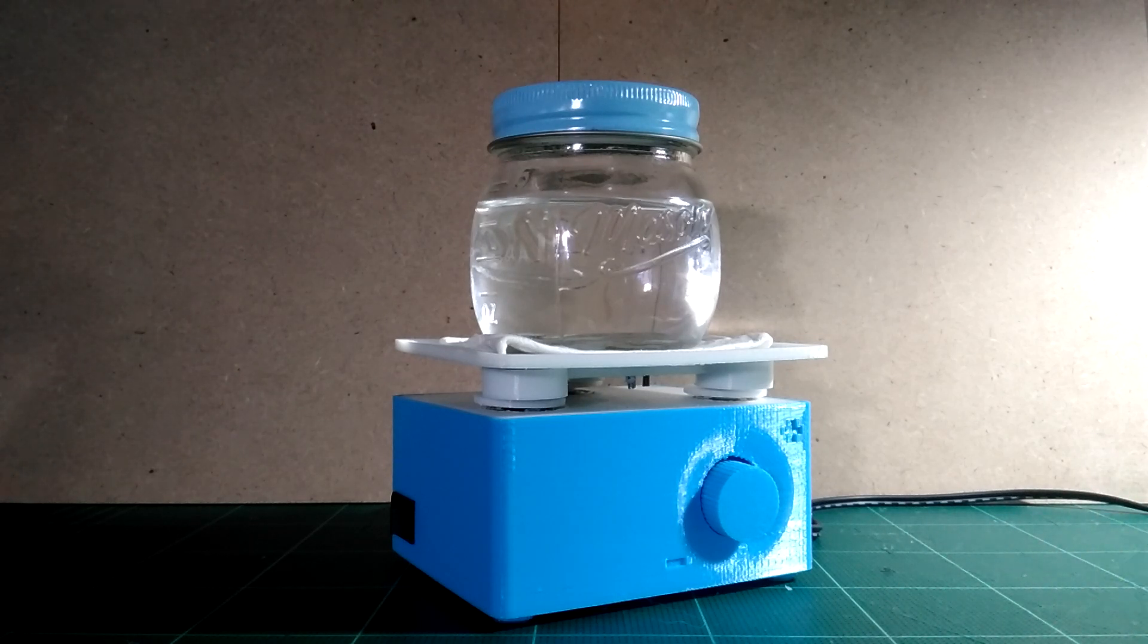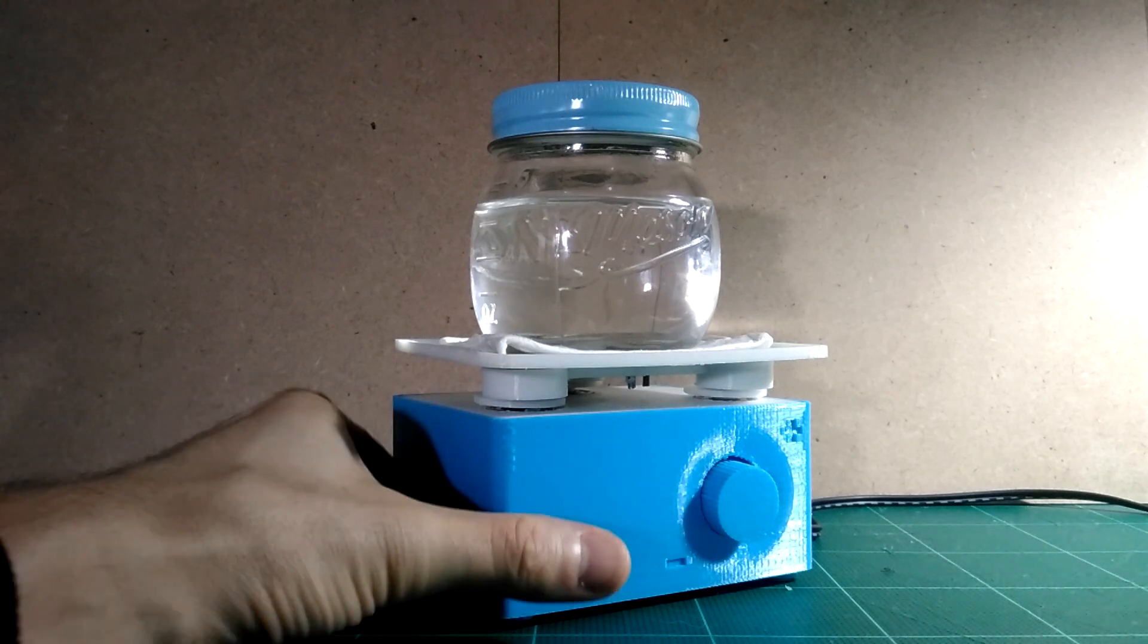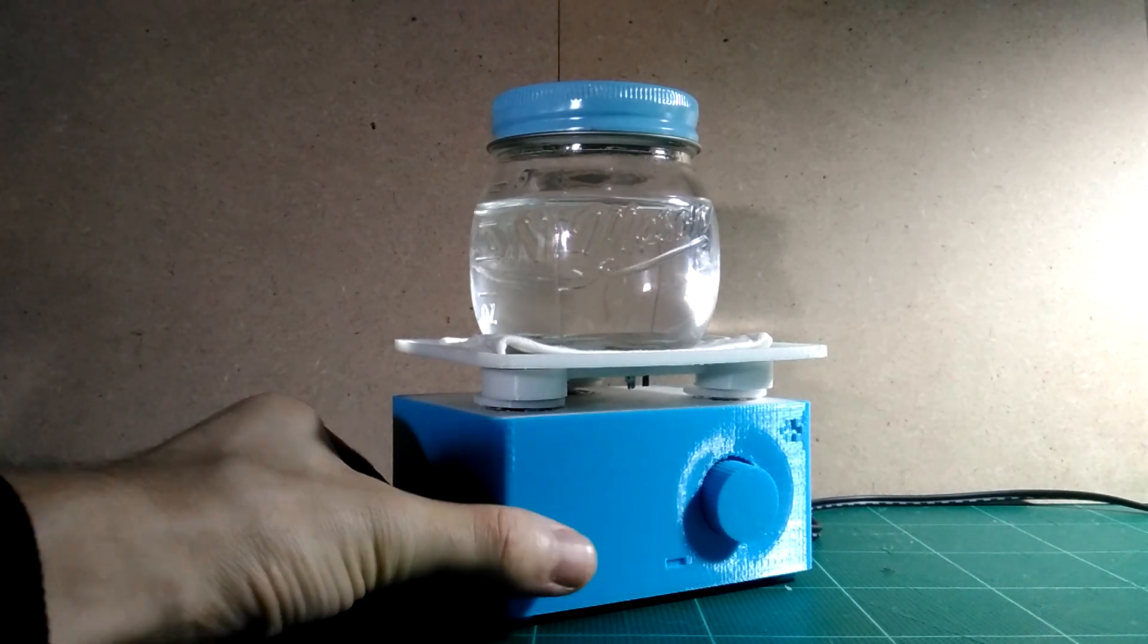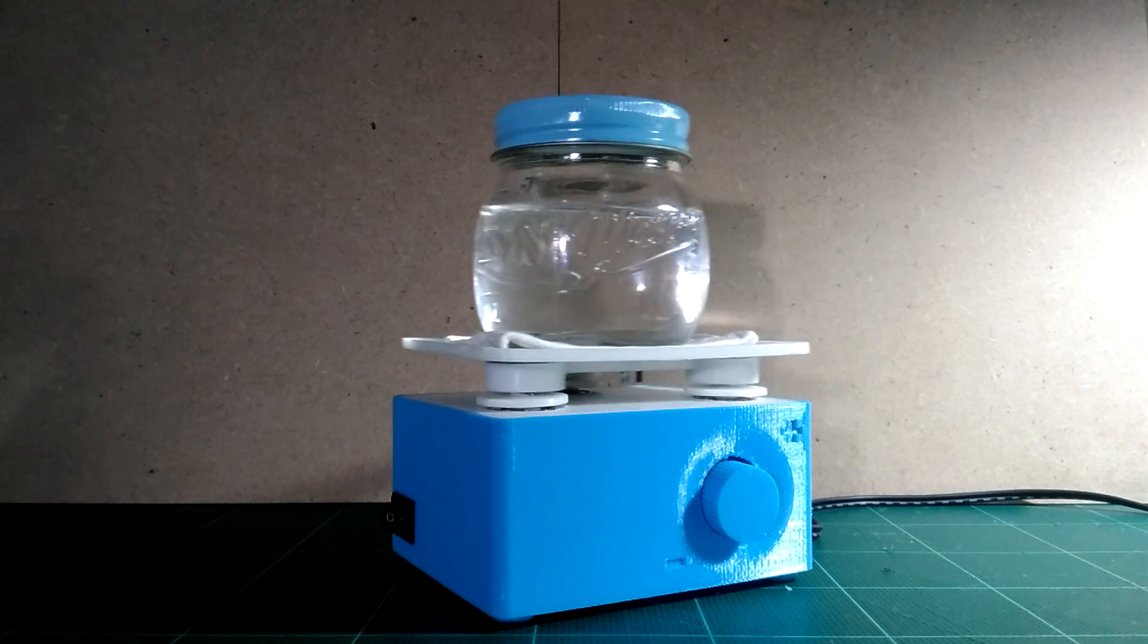This is the 3D printed orbital shaker. It has a power switch here. Switch it on and it's already moving.